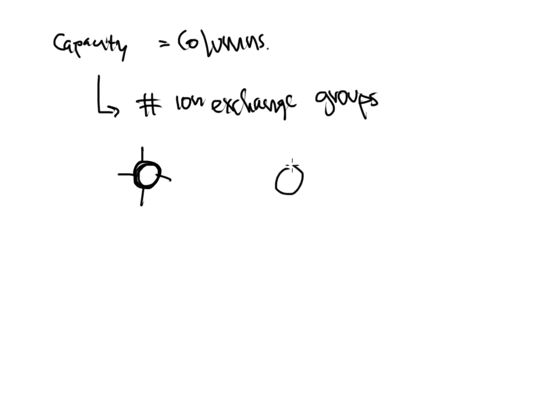So here we've got one that's got 4, and then here I can load this one down with more prongs, and what you'll see is that as an analyte comes in, it kind of gravitates toward one of these groups that are charged, and it hangs out there for a while. Well, this one's got 4 bedrooms, so it can hold a certain amount. Well, this particle has more bedrooms, so this one can hold more analyte, and this is what we would call a capacity of our column.